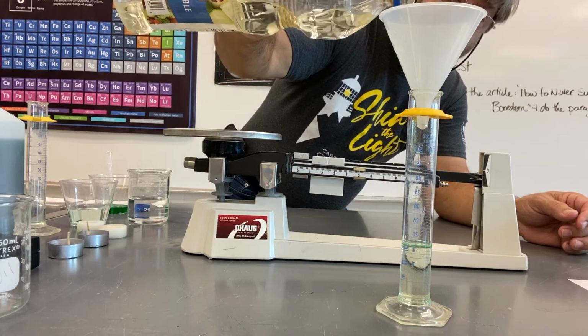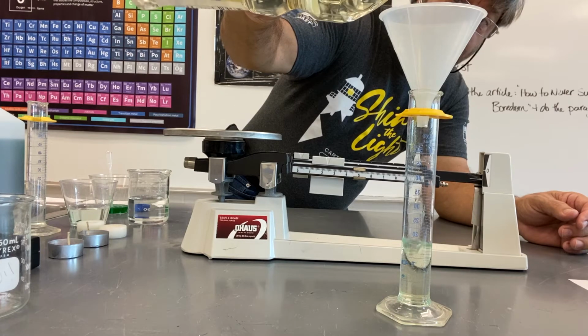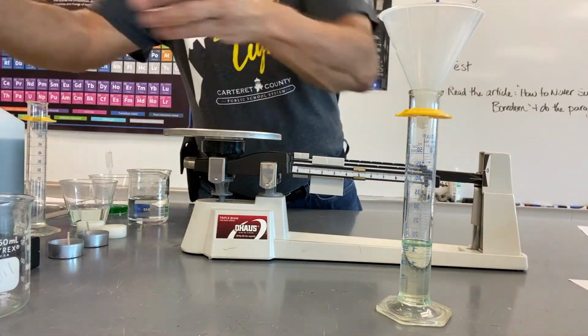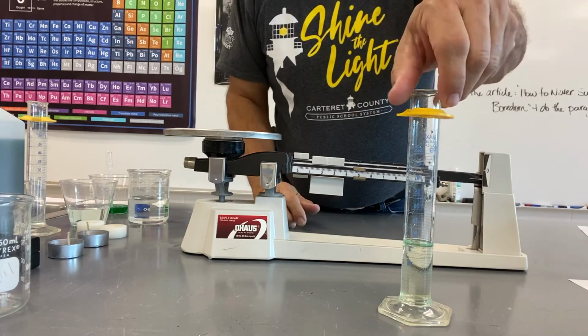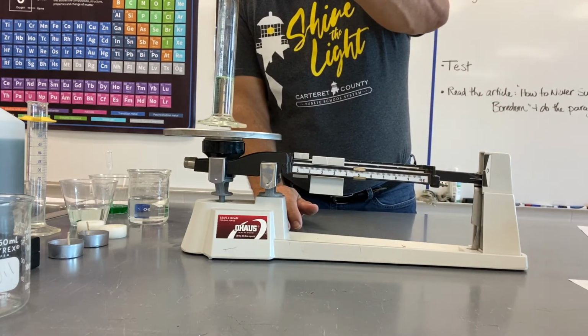I might be being silly here. It might have been worth just throwing the transfer pipette away. All right, that's got it. Ha, got lucky on that one. It was right at 20. There we go. So let's see what 20 milliliters of oil now weighs.